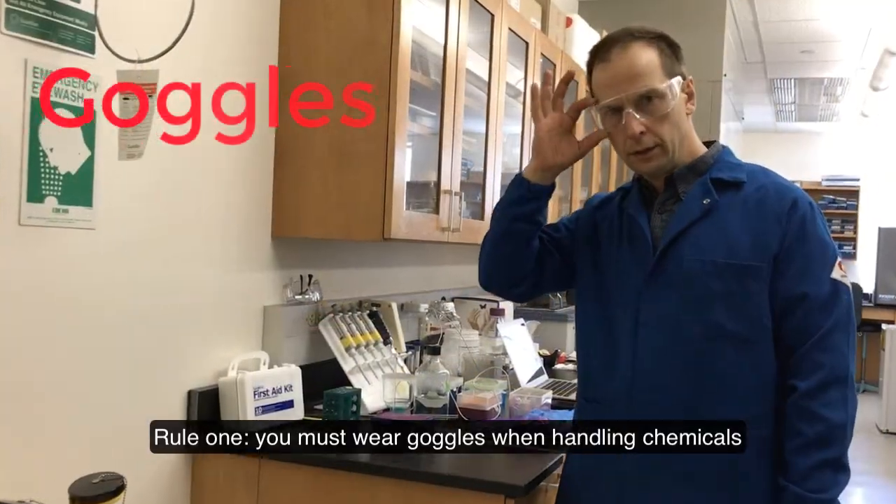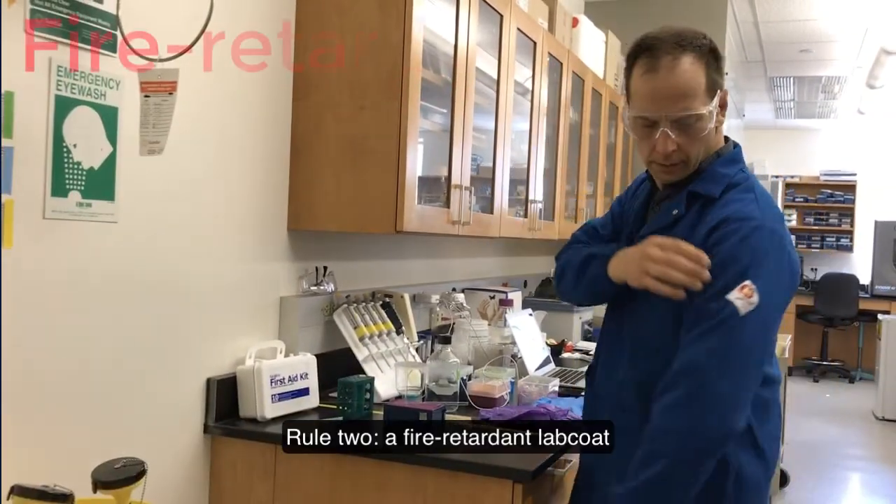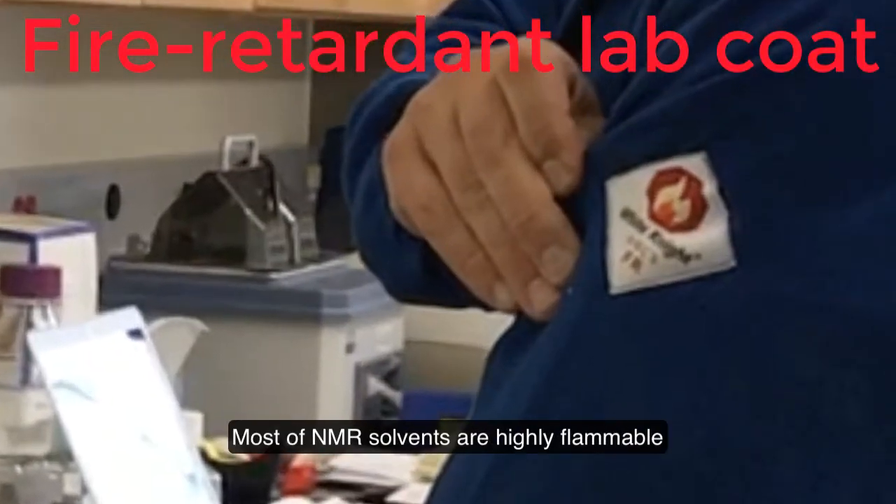Rule 1: You must wear goggles when handling chemicals. Rule 2: A fire retardant lab coat. Most NMR solvents are highly flammable.